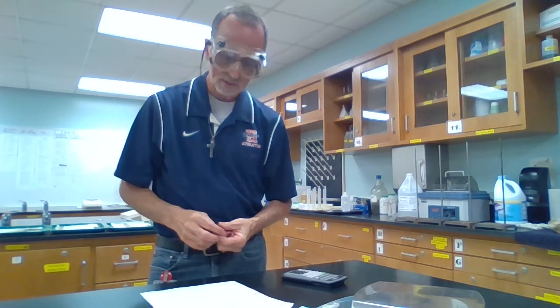So let's do the mass. Of course, we've already got 0. So 1 penny, 2.48 grams. Okay, this shouldn't be a surprise. So look back at 1 penny of the pre-82s. It was 3.08 grams. A penny now at post-82 is only 2.48 grams, which makes sense. If the pennies had the same volume and the zinc pennies, which these are, mostly zinc, are less dense than the copper pennies, the older ones, then the mass should be less. All right? So 2.48 grams for 1.